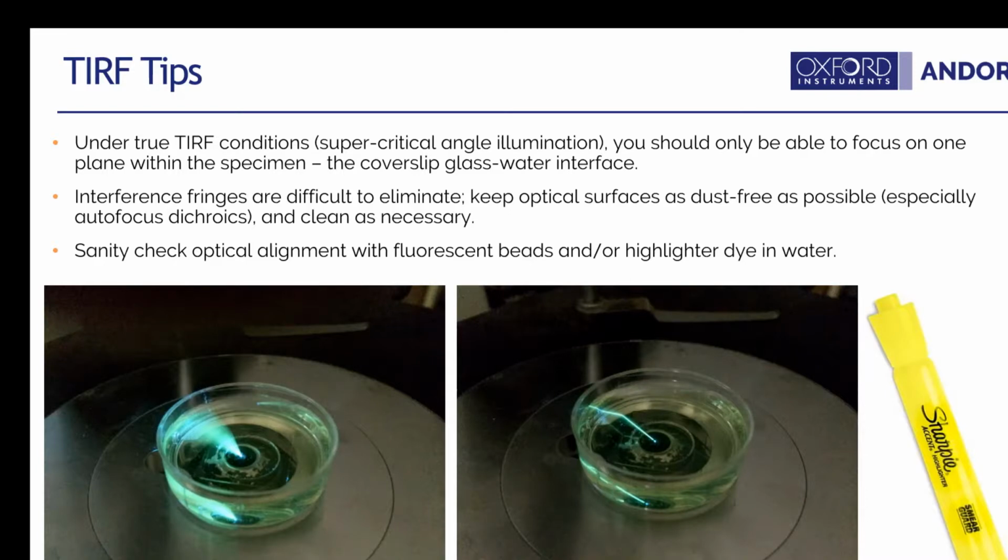The images here show that a dish of fluorescent water allows one to determine if the laser beam is focused to the objective lens backfocal plane and determine if the laser beam resides at a sub or supercritical angle of incidence.